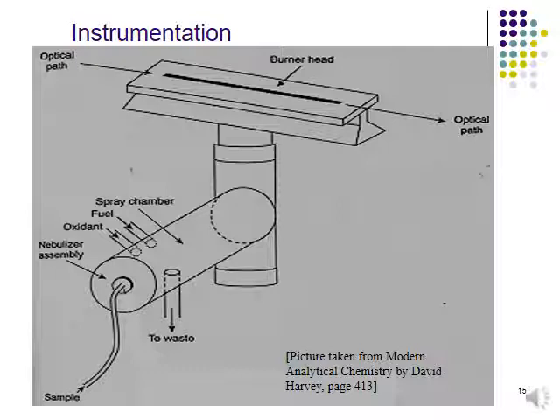Here you can see the burner head. At this part, the flame comes out, and then your sample also comes out here, and then your sample will get burned. After that, your very tiny particles of liquid solution will become the atoms.